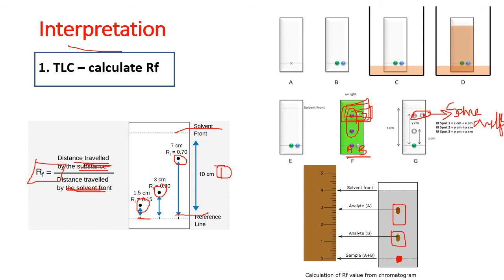What if I did an interpretation for this sheet? Then I have three samples, A, B, and C. In every sample, I just got one analyte, and the three analytes are different from each other since they have different RFs. Hopefully that I made it clear for you.